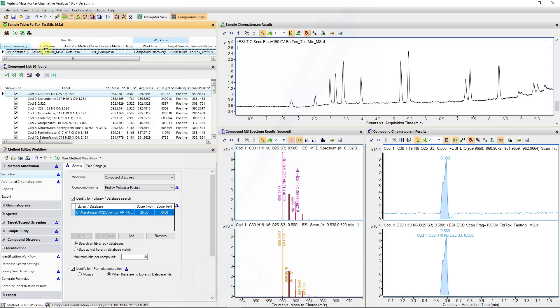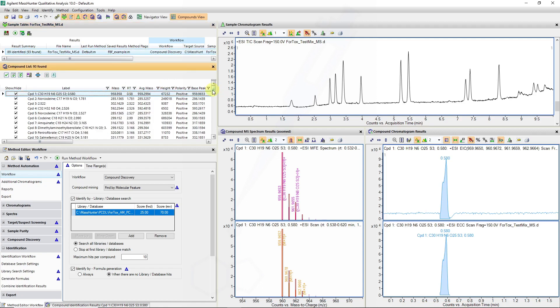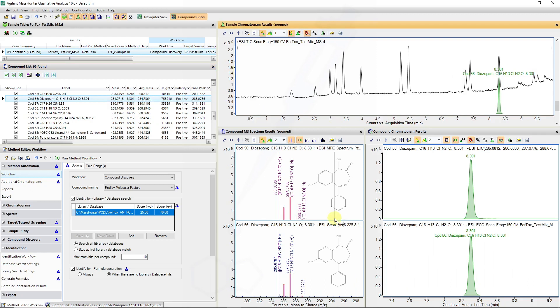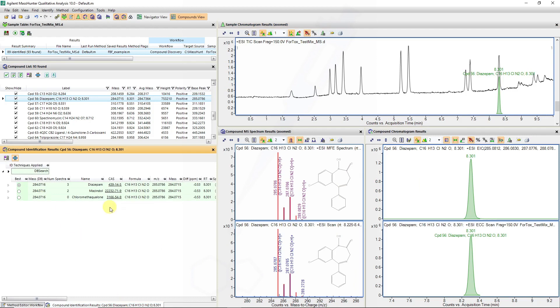We can now see that of the 94 features extracted by molecular feature extraction, 89 of them were identified. Looking at our diazepam molecule, we can see the diazepam molecule has been confirmed. Our database contains three different entries for isobaric species with the same formula, and all three entries were identified.